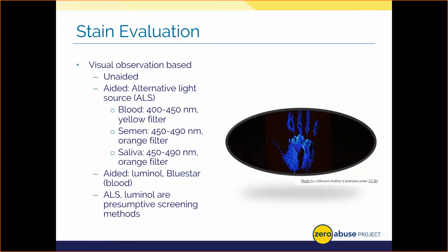Typically, blood would appear as a darker colored stain. Semen or saliva can be more light, or what I would call a white fluorescent color in appearance. Note that fluorescent aids can also assist in body fluid detection as well. For instance, you can consider the use of luminol, blue star, or other fluorescent sprays that bind to blood and cause them to light up under ultraviolet or UV light as screening methods for stains too.